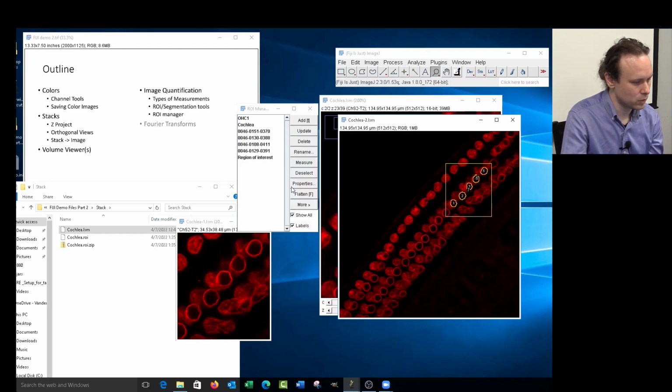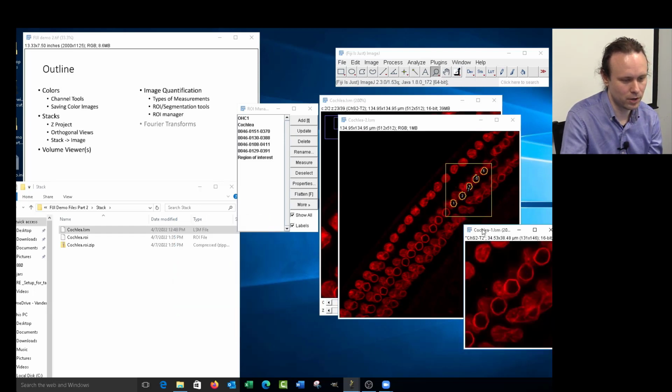I think that's largely it for the ROI manager. So are there any questions on this?